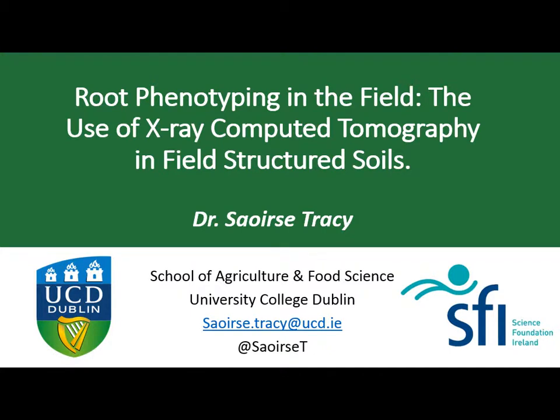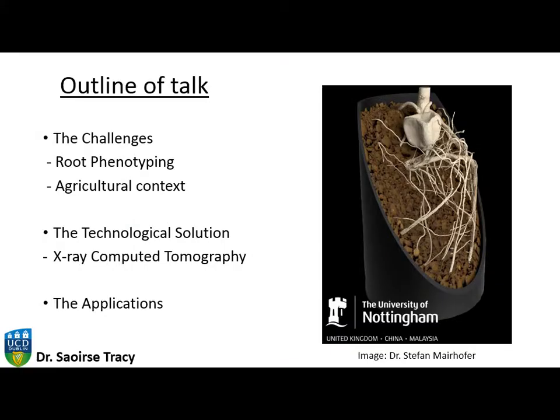Hopefully the slides will come back. So I'm going to tell you about some of my research at the moment about trying to root phenotype in the field, so using X-ray CT to look at roots in field-structured soils. Before I moved to Dublin, all of my research was pot-based. So we're just moving into more field-structured soils.